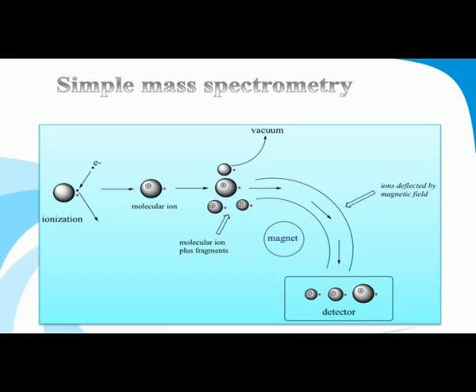During its passing through the analyzer, a magnet is also applied on both sides of the analyzer in such a way that, depending upon its charges, it gets separated. Here an electrostatic plate is also applied, which is perpendicular to the magnet.